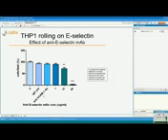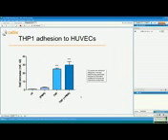This is actually different if we're trying to inhibit the E-selectin molecule. At 50 microgram per milliliter, this completely blocks the adhesion of THP1 cells on E-selectin. And in fact, it is actually rolling, which we observed in this case. It doesn't change for IgG control or for anti-VCAM antibody, but with the increase of the anti-E-selectin monoclonal antibody, we get a decrease of cells rolling on the E-selectin.